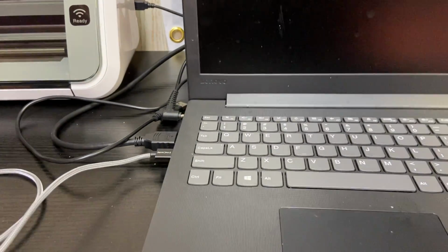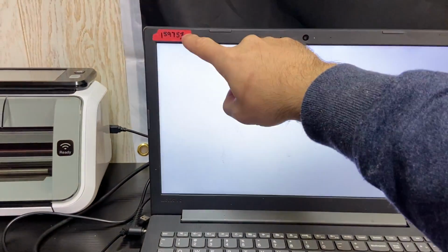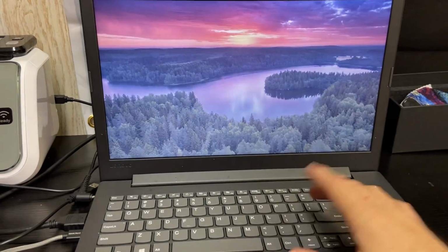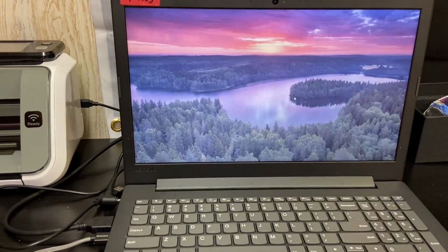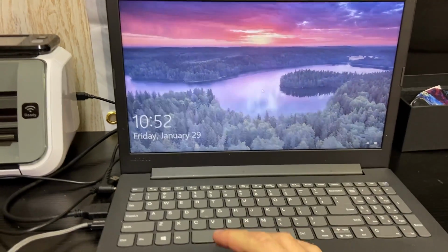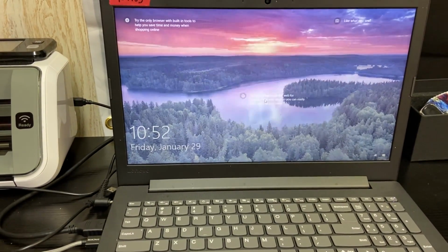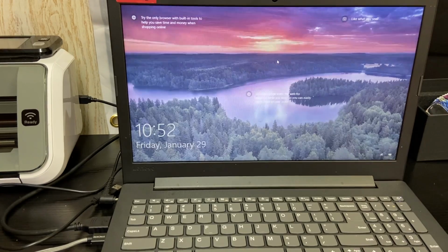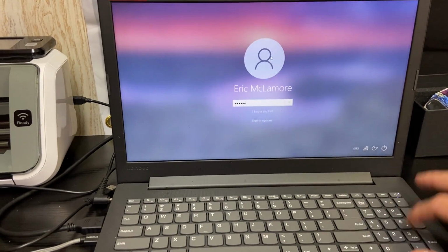And the software is installed on this laptop. Once it comes up, the code is here to get in. It's a little slow, even though it's brand new, so be patient. There's a pretty picture of a sunset if you need something to look at. Okay.